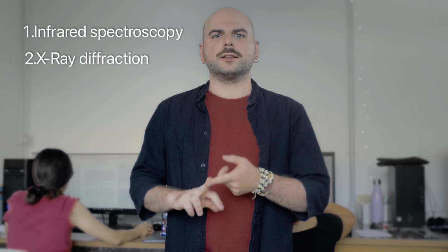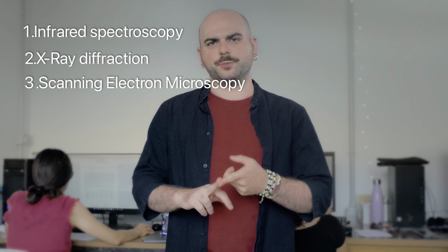In some cases, the authors supposed that the presence of lead calcium phosphate was due to degradation processes of the original materials. And in other cases, the hypothesis is that lead calcium phosphate was intentionally used by the artist. The main techniques used were infrared spectroscopy, X-ray diffraction, and scanning electron microscopy.